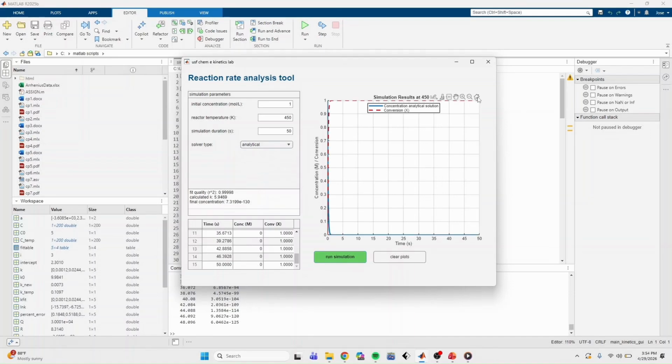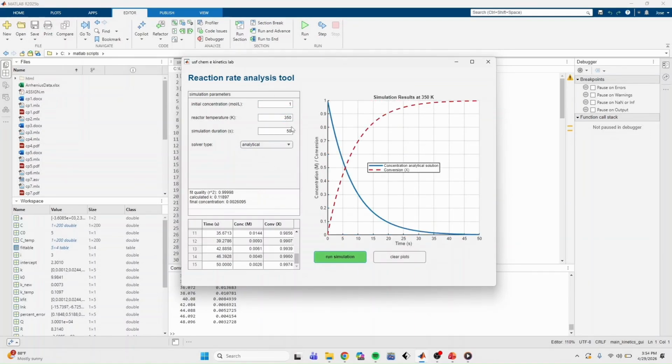Since we know how the reaction takes place at standard conditions, we can have the simulation predict how it would react in different concentrations or temperatures. Basically, we kind of ran a best fit line, and with that best fit line, we can change some aspects of it.